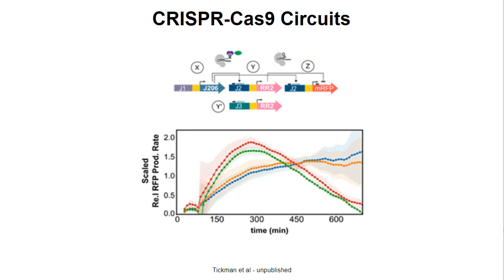So how much of X do we need? How much of Y do we need? How much of Z do we need? That's a lot of experiments, and we have to look at the whole parameter space. If we do these reactions by hand, looking at the parameter space takes a while, but doing it by Echo, it's faster, and so we can get the specifications of a circuit quicker.